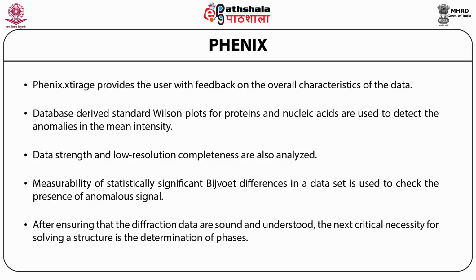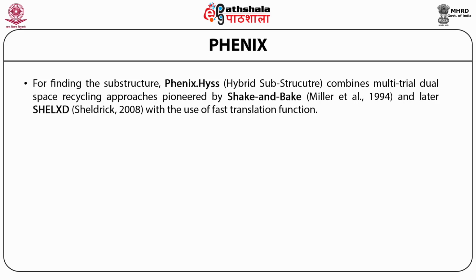After ensuring that the diffraction data are sound and understood, the next critical necessity for solving a structure is the determination of phases. For finding the substructure, we have a program called phenix.hyss, HySS, hybrid substructure search, which combines multi-trial dual space recycling procedures pioneered by Shake-and-Bake, written by Miller et al. So I was also a part of this program in the initial stages when I worked with the Nobel laureate Professor Herbert Hauptman at the Medical Foundation of Buffalo, New York. Shake-and-Bake is a program where a minimal function is used.